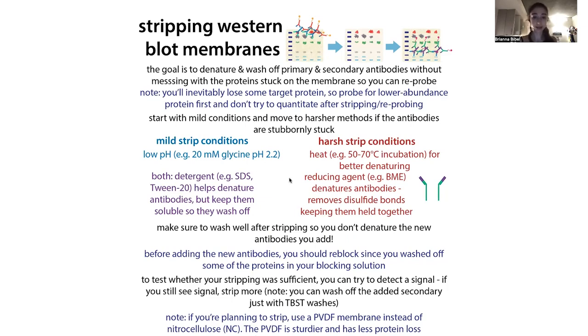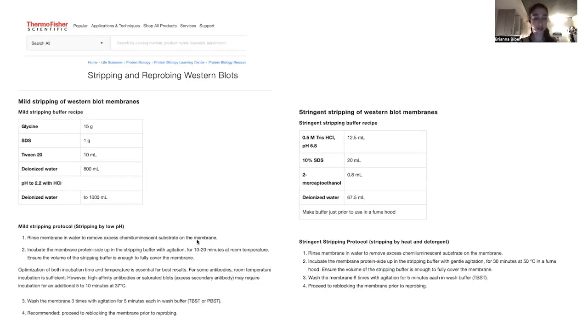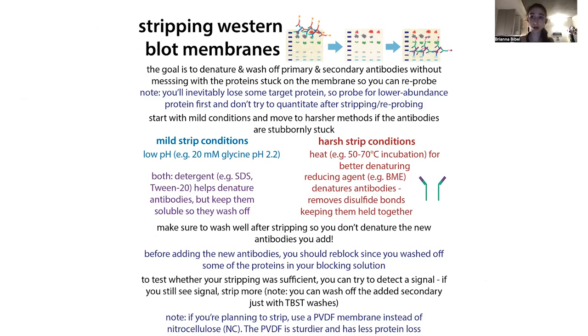Because you're adding denaturing agents with either of these, you want to make sure that you wash well after you do the stripping. Typically you do a longer wash with the stripping agent, 10 to 20 minutes or even 30 minutes, and then you want to do washes with TBST afterwards. Those washes are important because when you add new antibodies, you want to make sure that you're not messing up the antibodies that you just added.